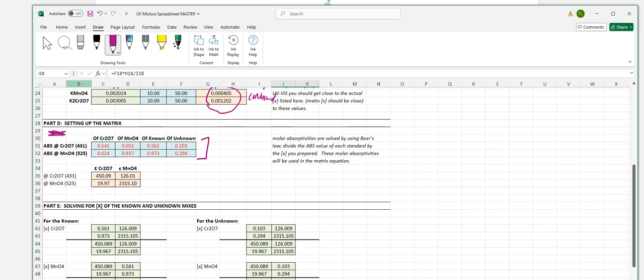There are blue values here, and I like to use blue because these are your laboratory data that you have on a report. That laboratory data is going to basically be your absorbance values. That's what these are. Look, ABS at chrome, ABS at manganese. So you have run something probably at 440, 430, somewhere in there, and all four of those solutions were analyzed at that wavelength.